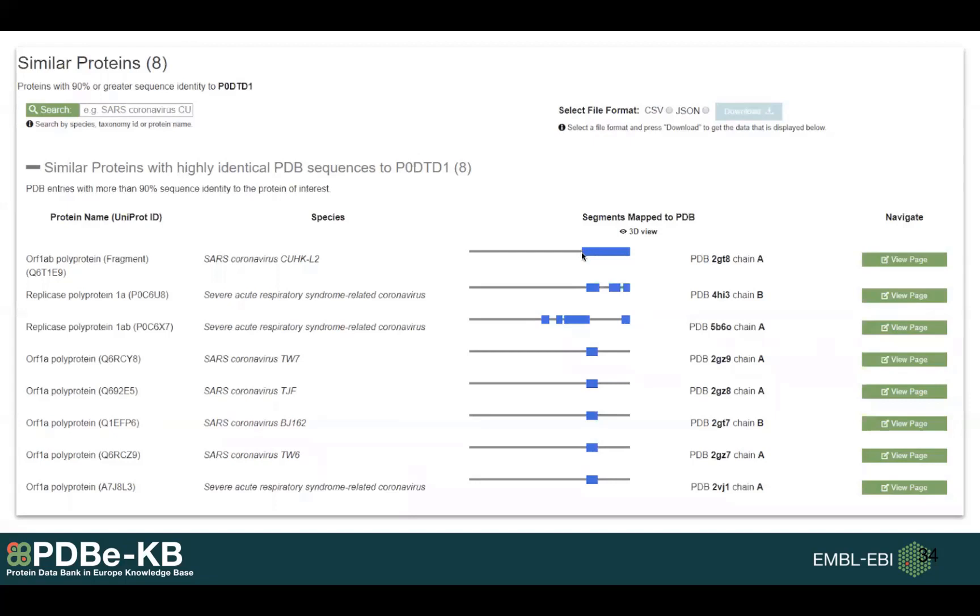It shows you where that PDB is mapped to. For example, this first row says that this particular UniProt has a PDB structure there which is 90% identical to a PDB structure mapped to the same segment of your protein of interest.